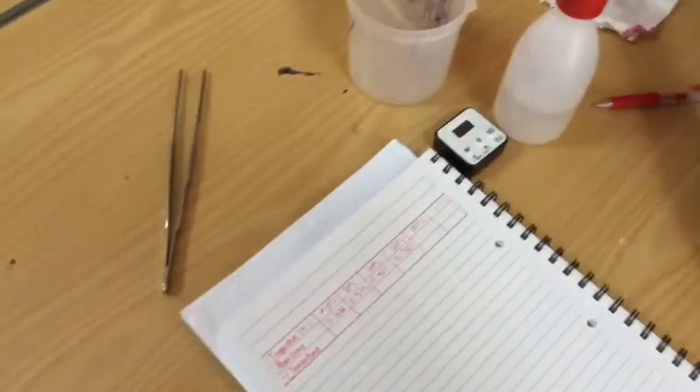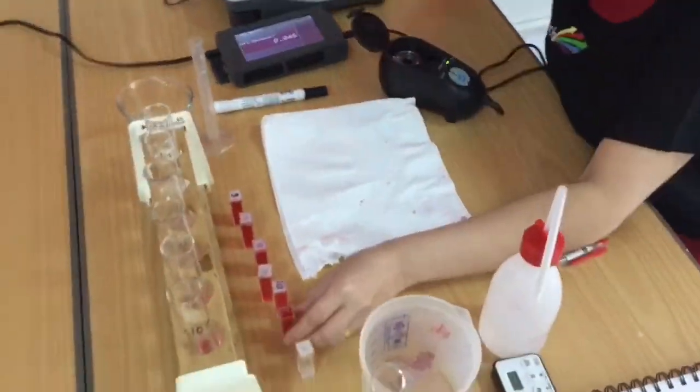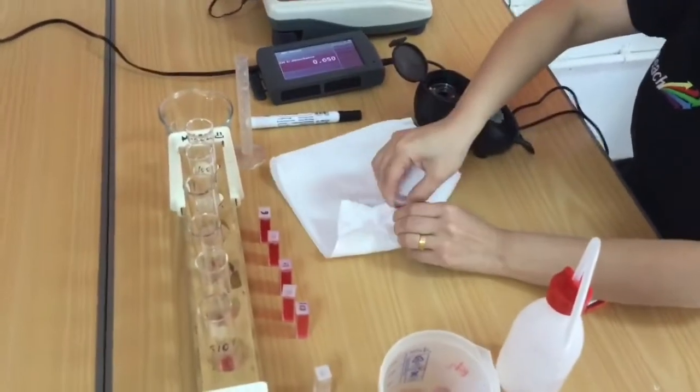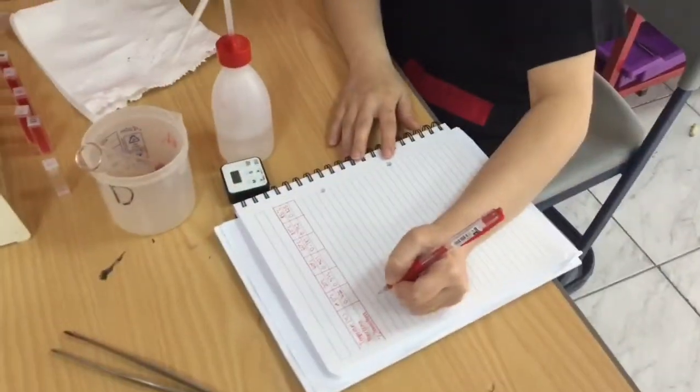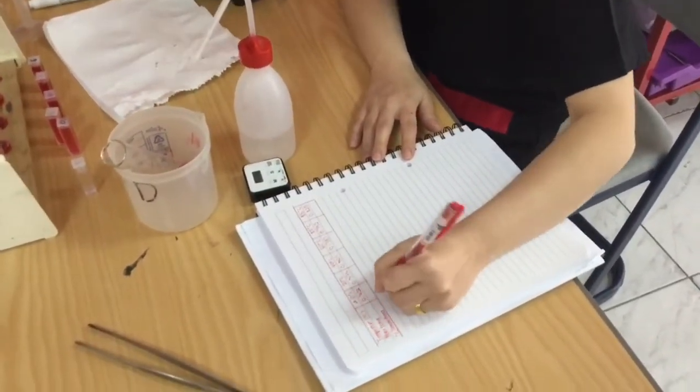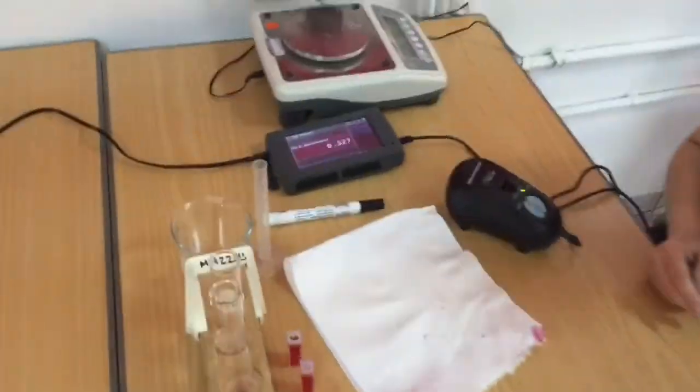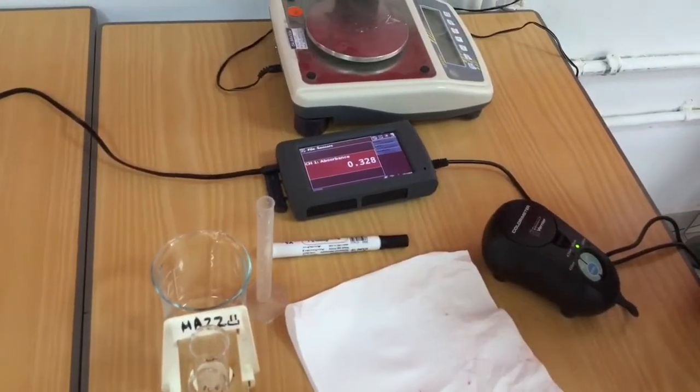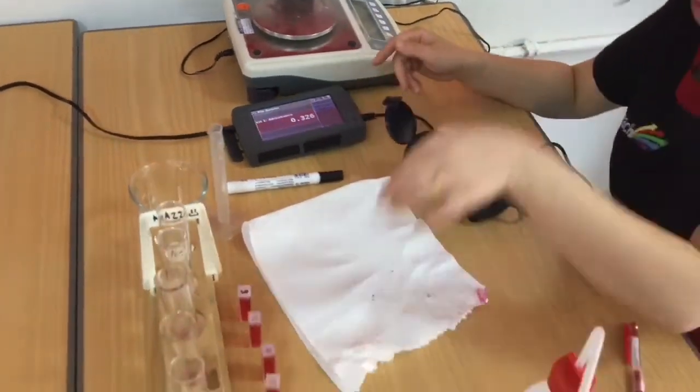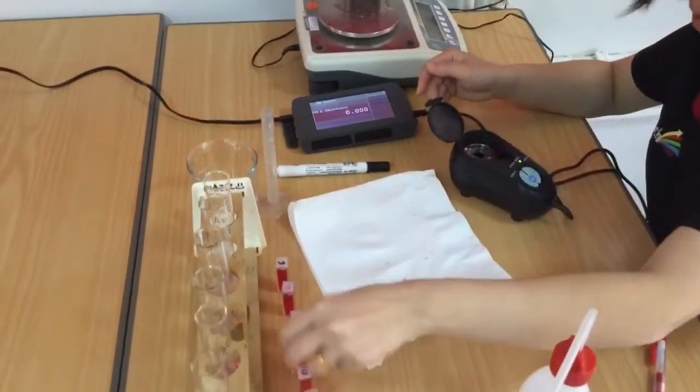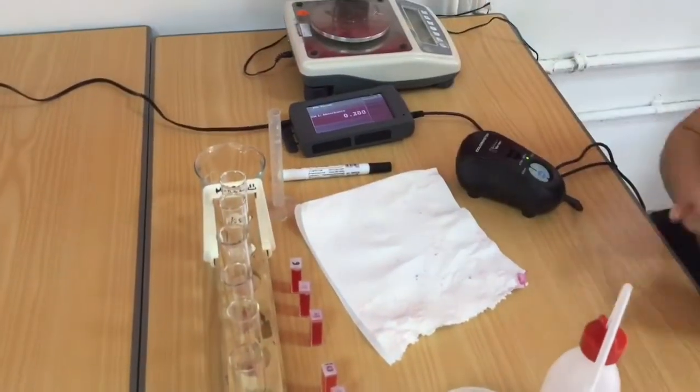As my results are being placed into the table, I can see that the pattern isn't quite what I expect. So I'm quickly going to extend my table and I'm going to do the readings again. However, what I'm going to do between each reading is pop the cuvette with distilled water back in there to ensure that the reading is zero, that my datalogger, my colorimeter, stays calibrated.